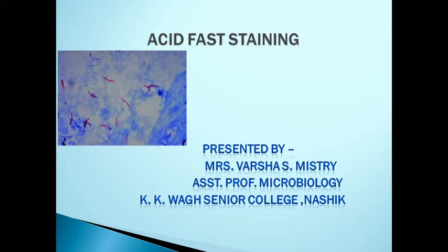acid treatment. And it is important to visualize the mycobacteria under the microscope. These mycobacteria are mainly the pathogenic microorganisms responsible for tuberculosis or leprosy. So it becomes necessary to visualize these microorganisms in a stained preparation, as these are difficult to stain by simple staining or by Gram staining. So it becomes necessary to apply a type of stain that is called the acid-fast staining.